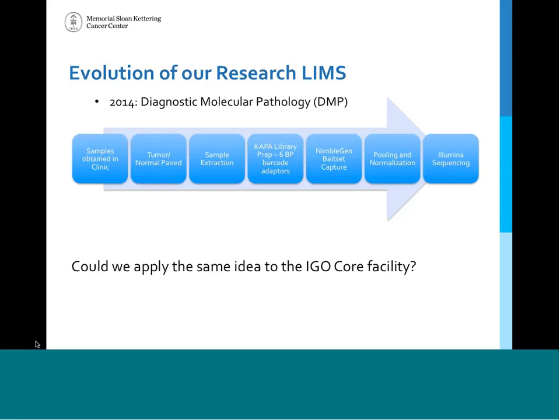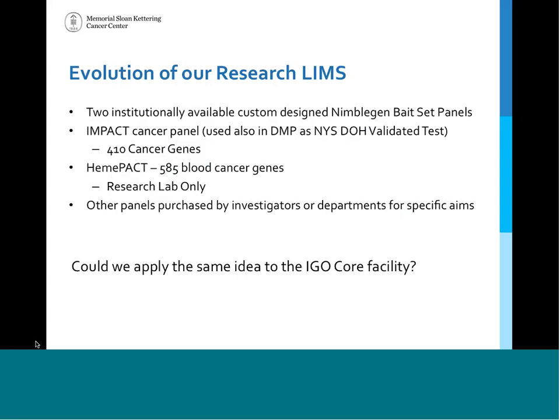So in 2014, we purchased the two systems, and the idea was to share workflows and experiences. We set up the research LIMS similarly to the way the LIMS was set up in the diagnostic molecular pathology group, where samples were obtained in the clinic, paired in a tumor-normal fashion, extracted, underwent library prep and then capture, and then were pooled, normalized and sequenced. This really went through one process, start to finish. Multiple workflows, but one general process. And so we tried to apply the same idea to the research core facility.